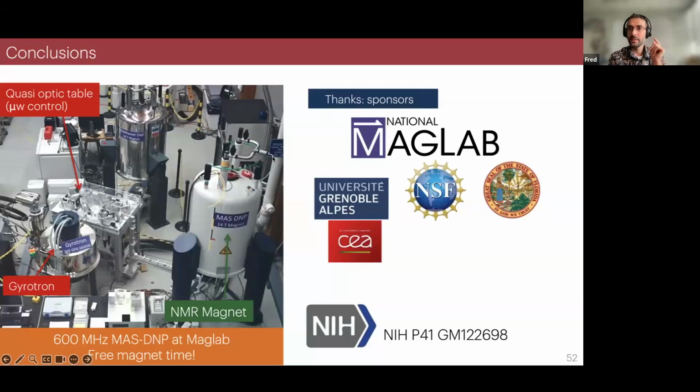My understanding is the protons will affect the T2 of the electron, not the T1. So I am not concerned about a change in the T1 because of protonation. If I'm super rigorous, I would say maybe deuteration would change slightly the phonon modes and therefore affect a little bit the relaxation. But to the zeroth order, I would say it's not affecting.